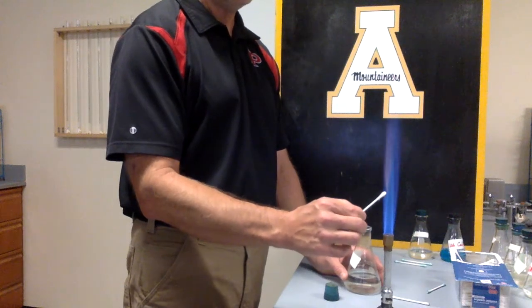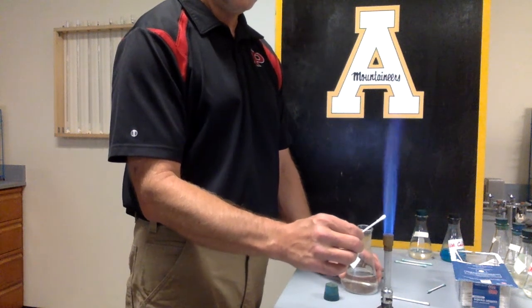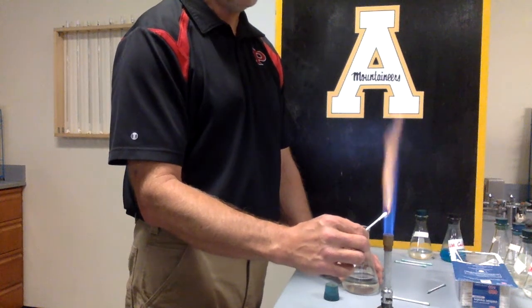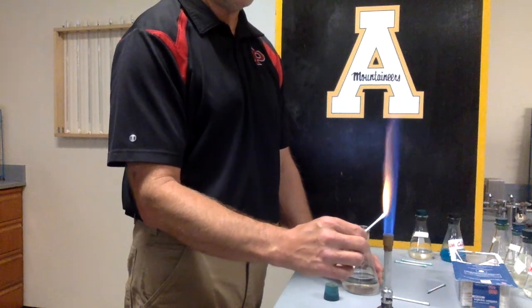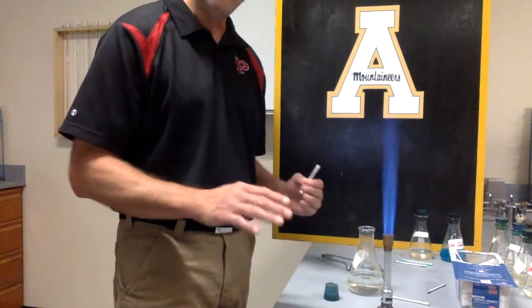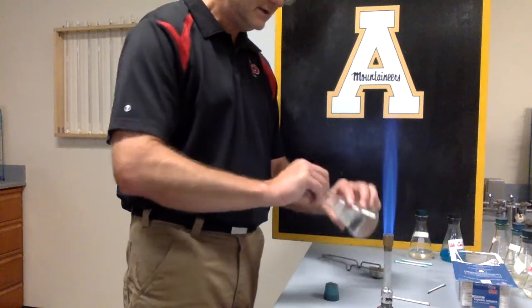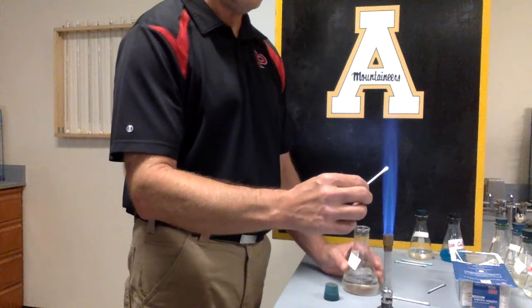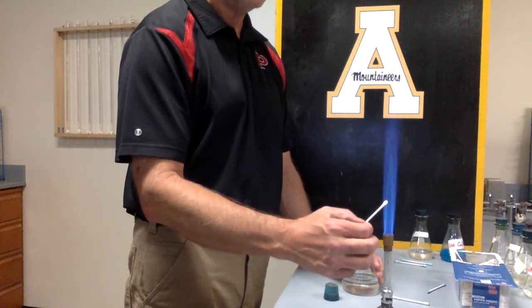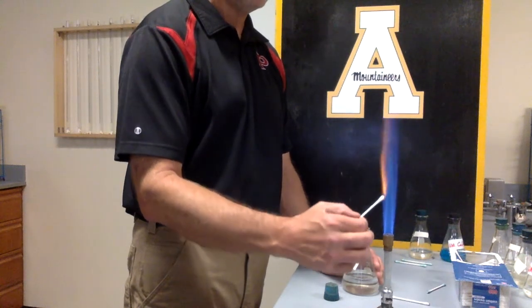If I look at this, you'll see that this is a barium nitrate. And barium, if you look at it, what would you call that? I think I would call it kind of like a flesh color. Maybe like your lips, or not quite a real soft skin color. Let's do that one again just to see if we can get a better color reading. Now, I'll hold it up a little bit. Sometimes, see if I can get it dried out just a little bit. All right. Can you see that kind of flashing up? Yeah.